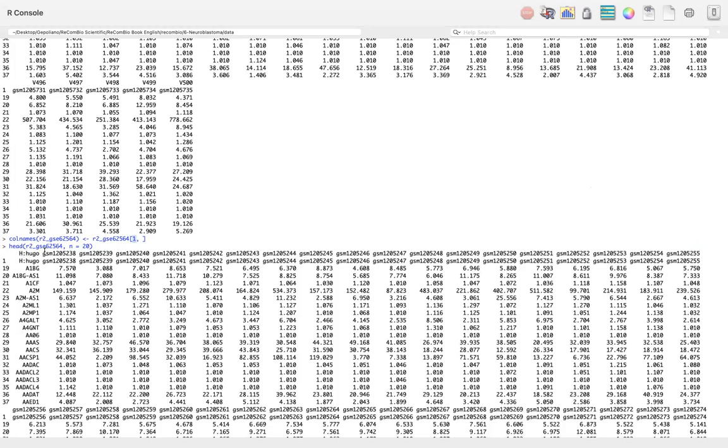I gave the columns the name of the very first row. So this is the row 1. These are the column names. And what this command here did was it named the columns of this data frame with the row number 1 names. I hope it makes some sense. So it gave the columns of the data set the row 1 names.